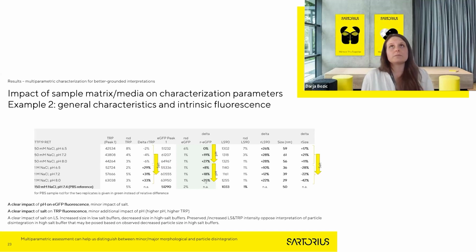And about whether shrinkage affects the bioactivity, I simply don't know. This is something that needs to be assessed. Also, one possible control of whether it is shrinkage of the particles or actual degradation is that one can dialyze the sample back and observe if the particles swell, and one obtains again the same size as before shrinkage or not. So yeah.